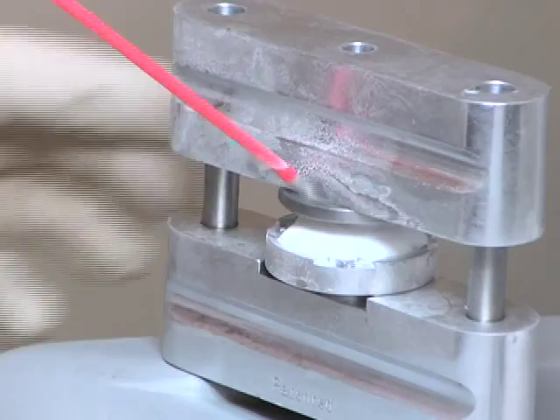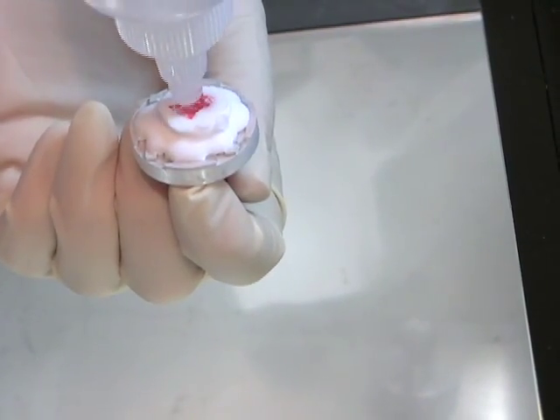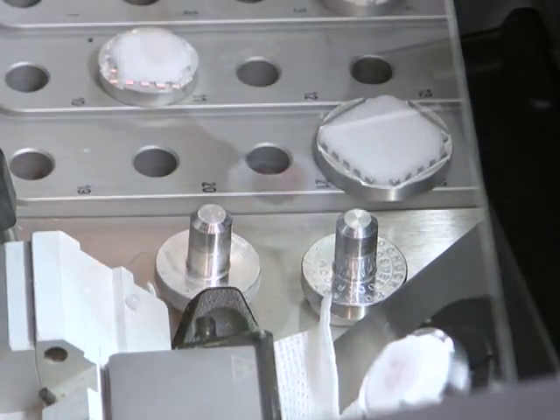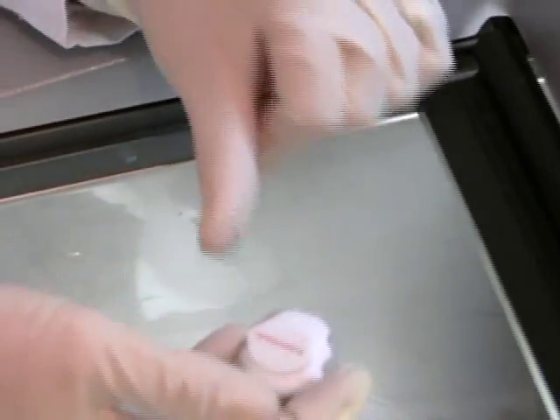Although the design of the cryoembedder reduces the need to make major adjustments of the block to be in alignment with the blade, it's best to be cautious and apply a thin buffer layer to prevent the blade from damaging the specimen. This can be done on larger or darker specimens by putting a drop of embedding medium over the bare tissue and placing it on the floor of the cryostat. With smaller specimens that may be difficult to see, simply smooth a thin layer over the bare tissue to provide a protective layer, yet still see the shape of the specimen.